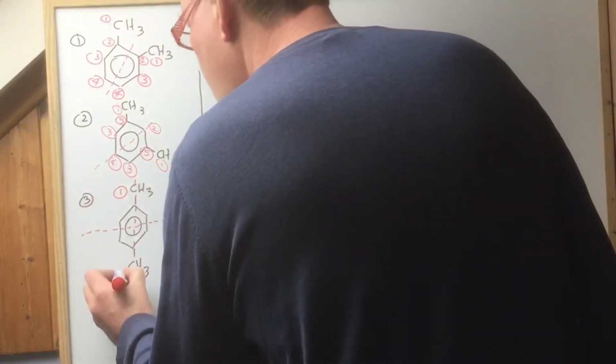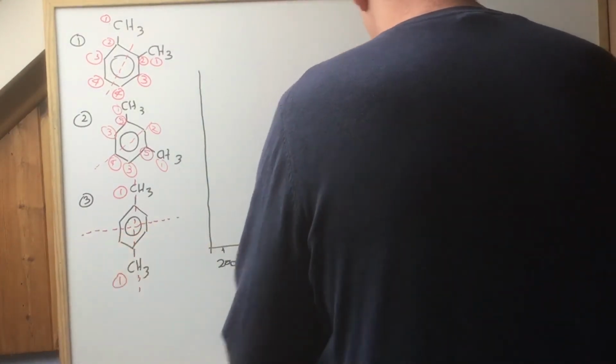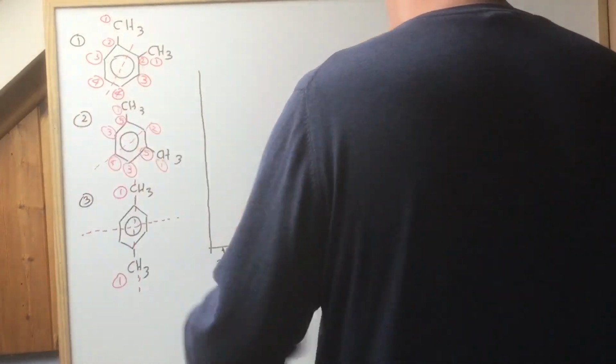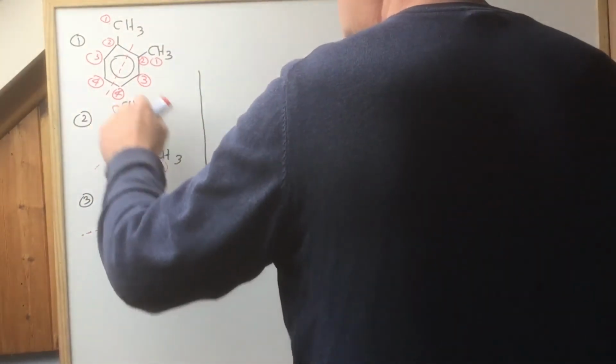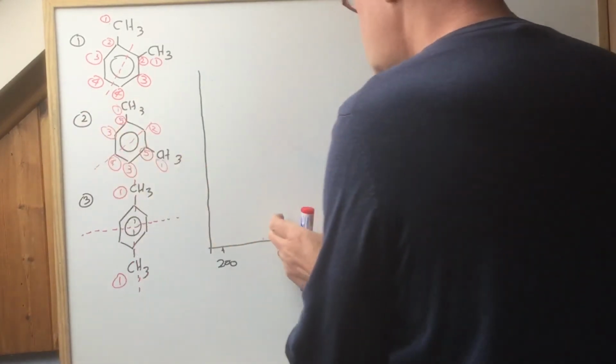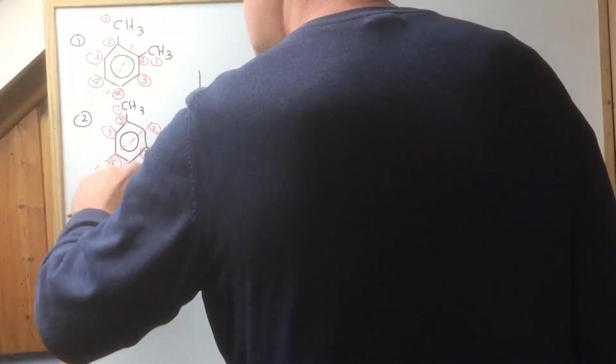1, 1. Same deal. Down here. I should have done that with those 2 on the previous one. I should have put those 2 C's further down because they're not part of the aromatic ring. So I shouldn't have clustered the 5 together. I should have put 1 down here and 4 together. 4, 1, 2, 3, 4.